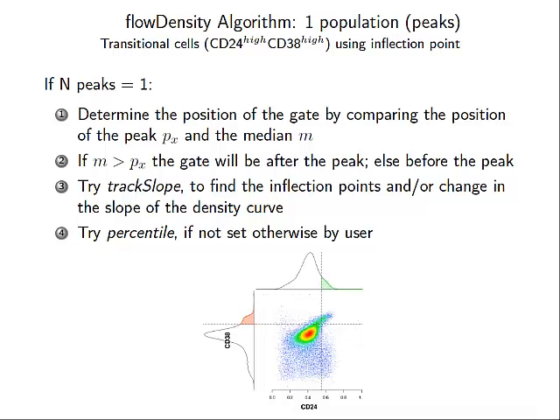You have to take the rules that are in your head. I think we were talking about this yesterday. These rules that you have in your head, you have to encode them into R. And the rules that seem to work are, well, I'm looking for a bump. You see that by eye, but now you have to tell the computer, look for a bump. Or you have in your head that maybe it's the 95th percentile.